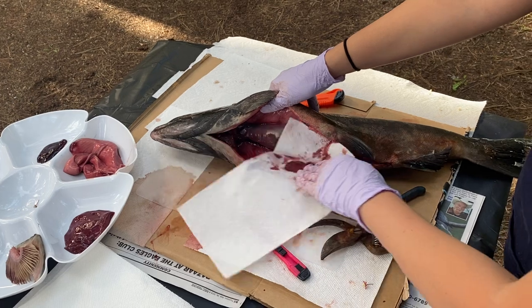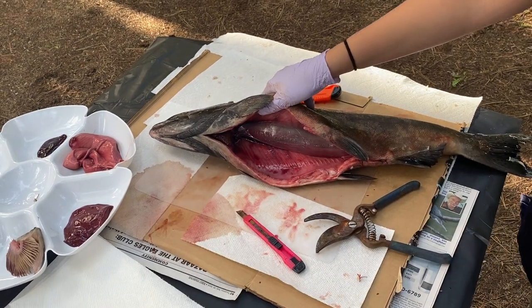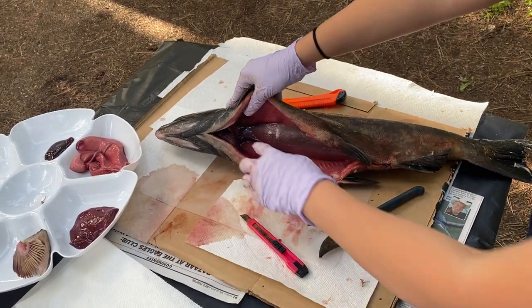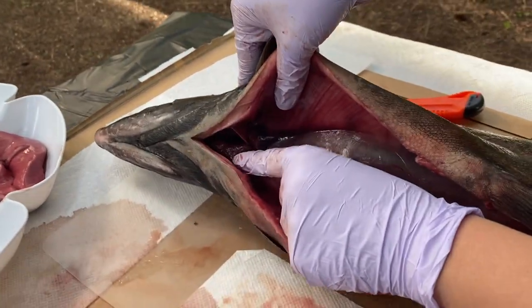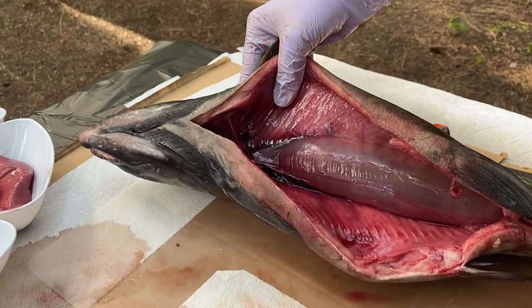Now we will go to the heart of the salmon. The heart of the salmon is in its own special little chamber up behind. So there's a little wall, kind of a membrane in here, and then the heart is inside here. So I'm going to cut the heart out.